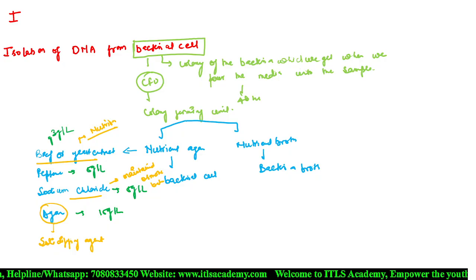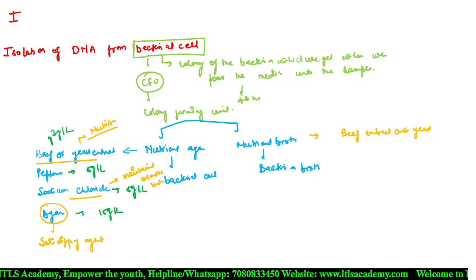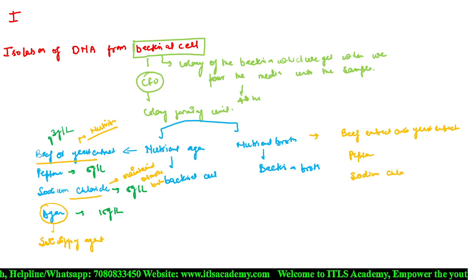Nutrient broth consists of the beef extract or yeast extract, peptone and sodium chloride in the same amount, but the agar is not present.